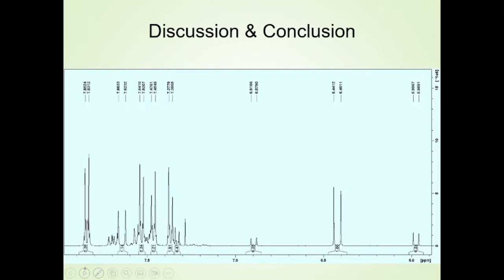For example, if you look at the aldehyde peak out around 10 ppm, if you set that to 1, look for the peaks in the aromatic region that are integrating to 2, and you should be able to identify the aromatic. And then when you set one of these to 1, you can look which ones integrate to 2 and match that. Although if you have a lot of impurities, the integrations may be a little messy anyway, so it may be a little problematic. And if that's the issue, don't worry about it.